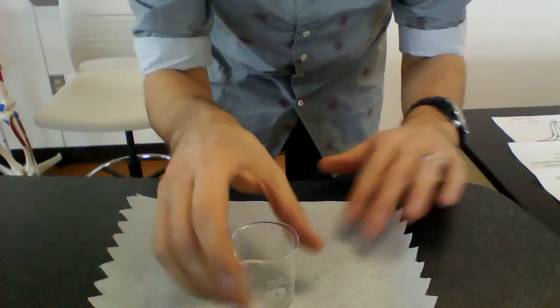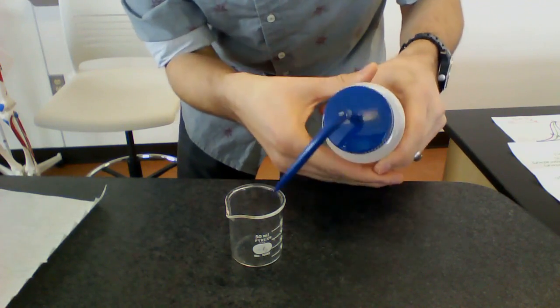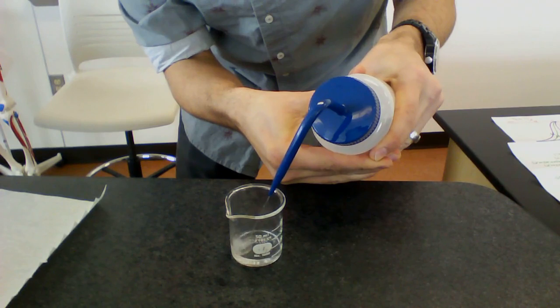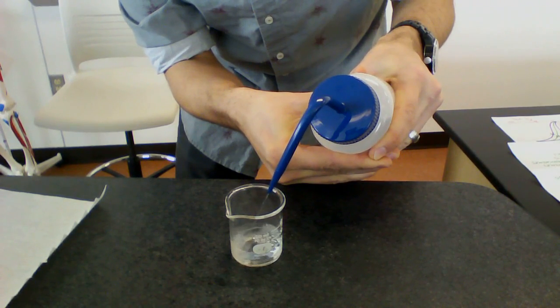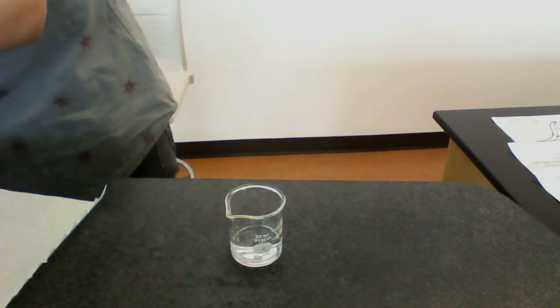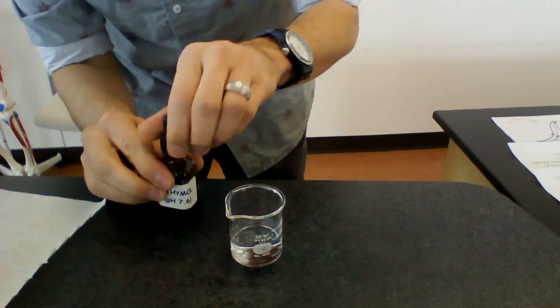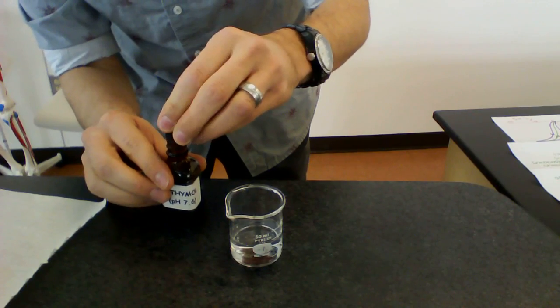Okay, if I can tilt this down to show you what's going on. Here's what we have. Take a beaker. Actually, it probably looks better without the effort. Take the beaker. We're going to put some distilled water in, and we'll fill it like halfway up. Something like that. And then we're going to add bromothymol blue. Now, bromothymol blue is going to be your pH indicator. So hopefully this distilled water is good and it's pH 7.0.